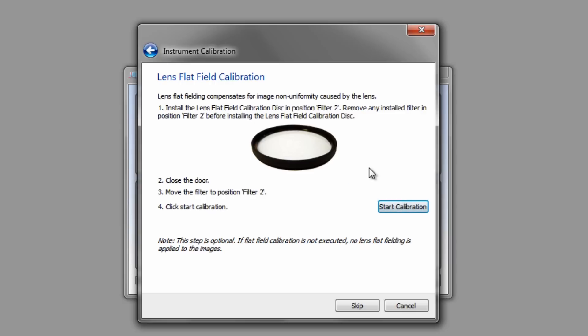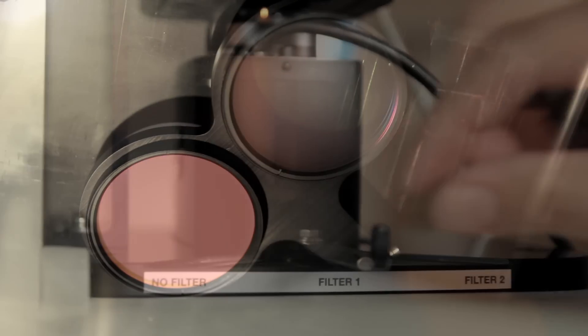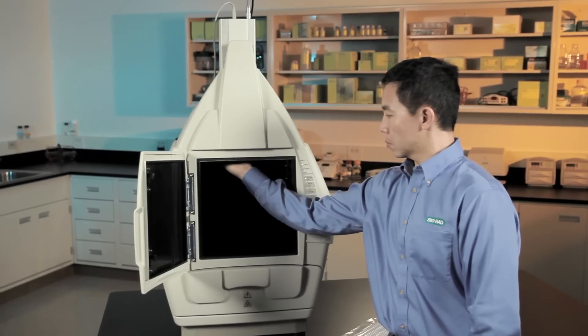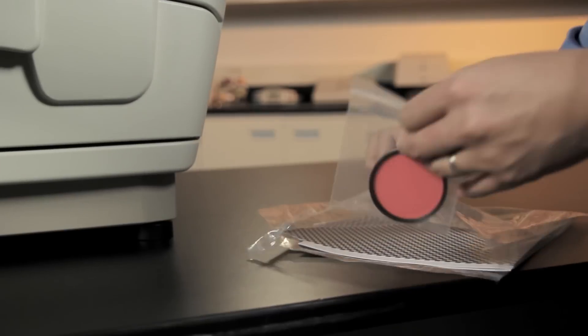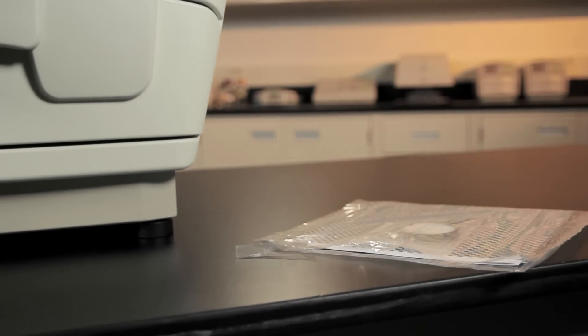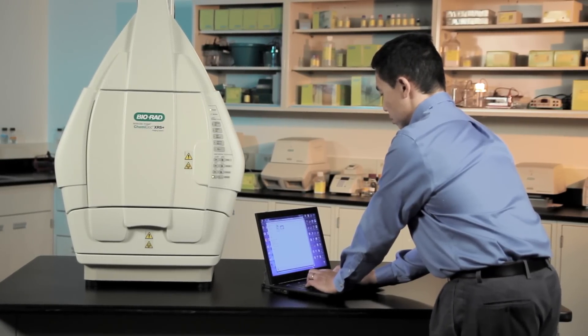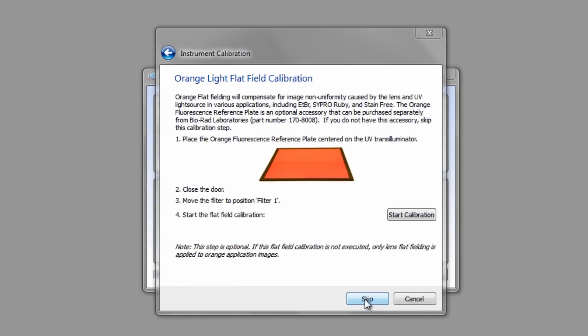Remove the screen after calibration when prompted and acquire the bias value correction. Next, we will flat field the lens to correct for any non-uniformity inherent in the lens. Find the flat fielding disc from the installation kit and screw it into the empty position on the filter holder. Move the filter to position two and start flat fielding calibration. Once calibration is complete, remove the disc and store it with the focus target in the installation kit. Keep the installation kit near the imager for future calibrations if the ChemiDoc XRS Plus is moved to a different computer. If you have the optional white light conversion screen or the orange fluorescent reference plate, follow the on-screen instructions to carry out the illumination flat fielding. If not, you can skip these steps.